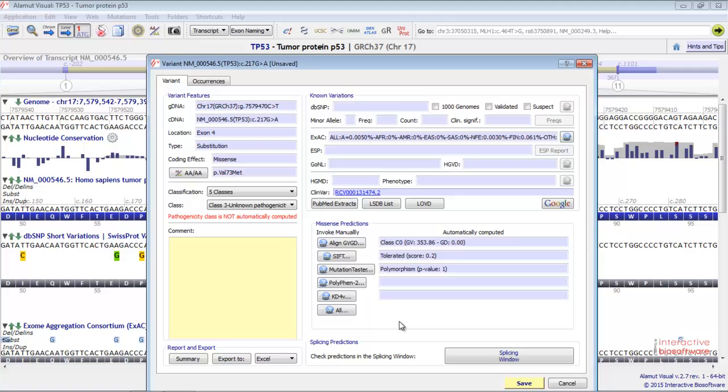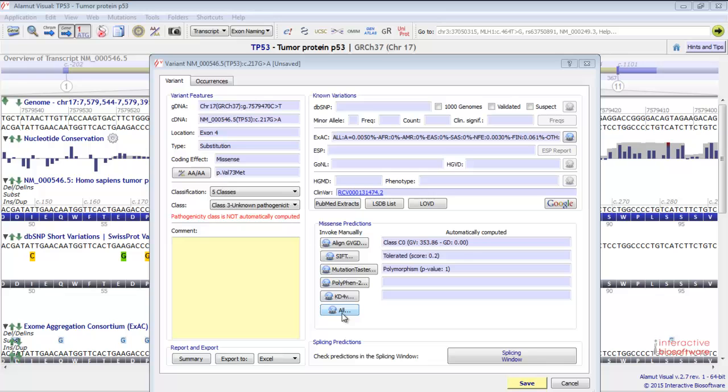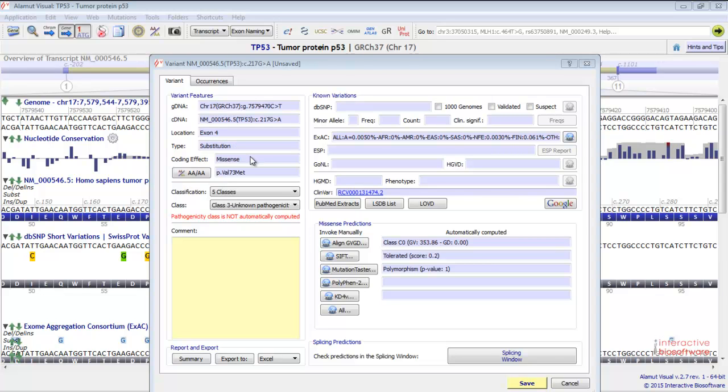The variant window appears. You have some information about the mutation you've just created. First you have the HGVS nomenclature, the location of the variant, the type - here we have a substitution - the coding effect. We've created a missense mutation.